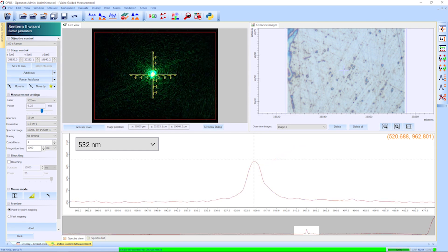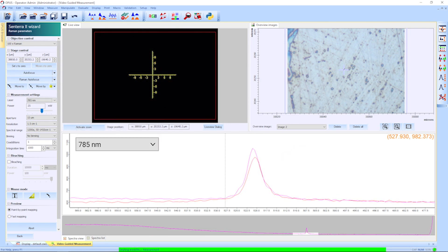Let's switch to the 785 nanometer laser and compare. The Raman peak is found at 520.7 wavenumber again, and compared with the literature this is exactly where it is supposed to be.